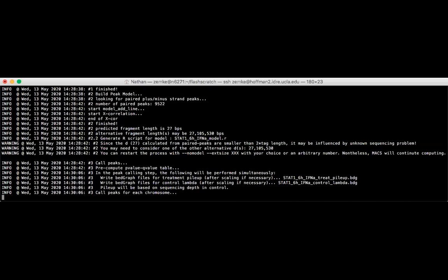Also, something we're not doing, but you probably learned in a different Collaboratory course, is you can submit jobs into the queue where the jobs are running basically in the background on the Hoffman, and you don't have to stay logged in and sit and watch them run. And you can run a lot of parallel jobs that way as well.